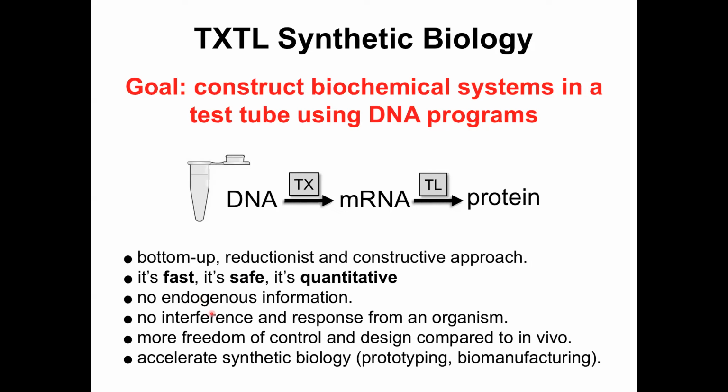What I like is that there is no interference and response from an organism, so there is more freedom of control and design compared to in vivo. And the practicality of cell-free systems has been demonstrated many times now. It's really a useful platform to accelerate synthetic biology, especially prototyping and biomanufacturing. I was saying that there are disadvantages. Cell-free expression is not as powerful as gene expression in a living organism, but you will see the latest cell-free systems are powerful enough to really execute large DNA programs.